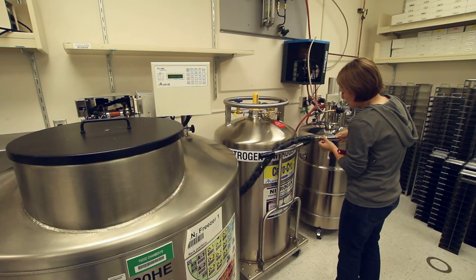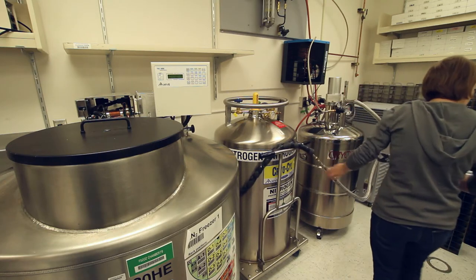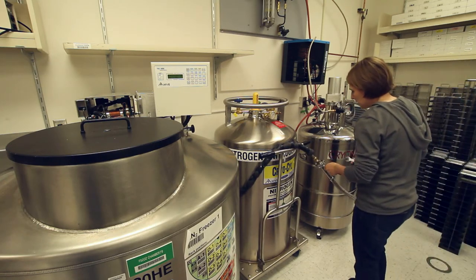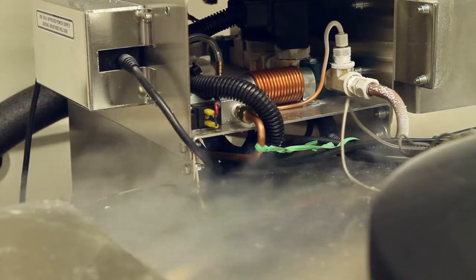Loan request for tissues is probably one of the most used collections in the museum. I start with a tube about the size of a peanut, and then from that you extract about a piece of tissue half the size of a flax seed, and that's probably enough for about two DNA extractions.